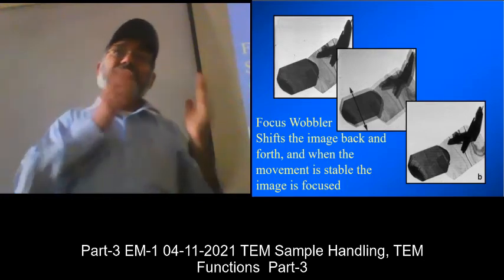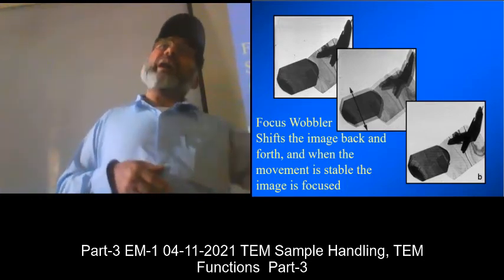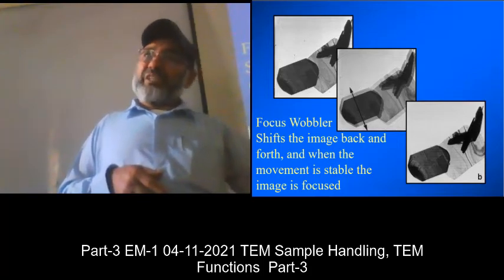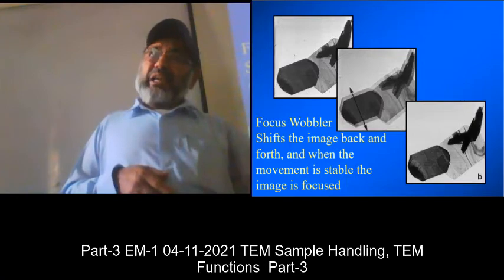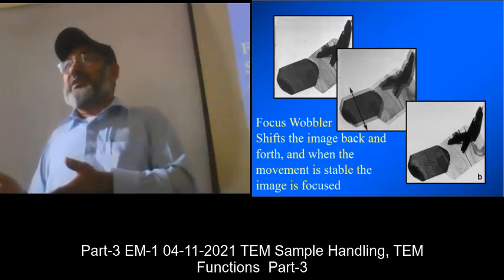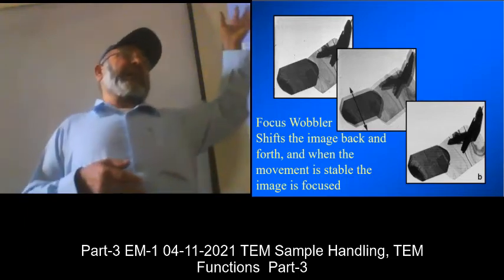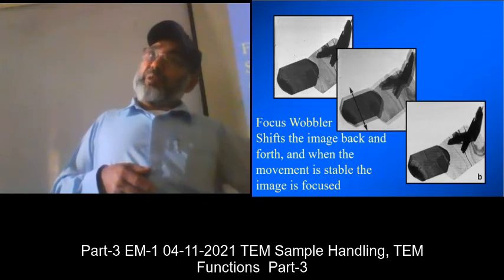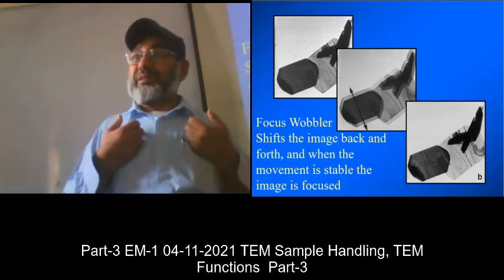If you are reporting something unusual, then go back to your machine and refocus it, relook into it. And if it is again coming, then show it to some experienced person, to check whether it is in fact a different result than the one reported, or I am making some mistake.